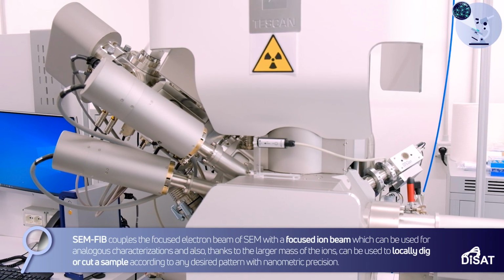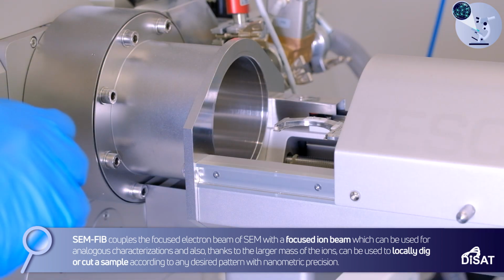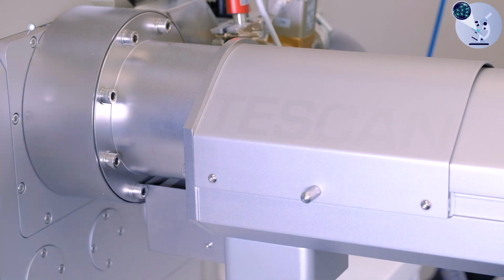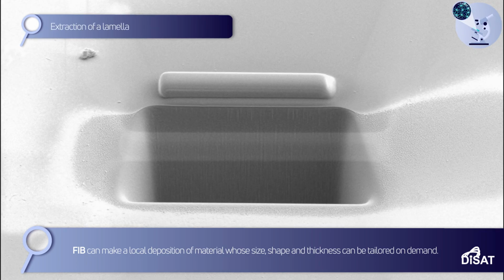SEM-FIB couples the focused electron beam of SEM with a focused ion beam, which can be used for analogous characterizations and also, thanks to the larger mass of the ions, can be used to locally dig or cut a sample according to any desired pattern with nanometric precision. FIB can make a local deposition of material whose size, shape and thickness can be tailored on demand.